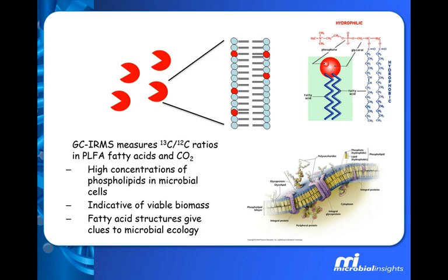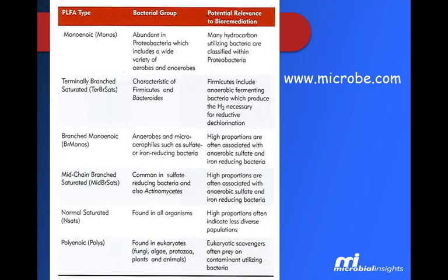As I said, there are about 14 to 16 common structural varieties of those nonpolar tails, and as I'll illustrate a bit later, that can give you some idea of what types of organisms you're looking at here. If you determine that C13 has been incorporated into certain kinds of lipids, or incorporated at greater amounts in certain kinds of lipids, it gives you information about which organisms are more involved in the cycling of that C13. But I'll illustrate that later.